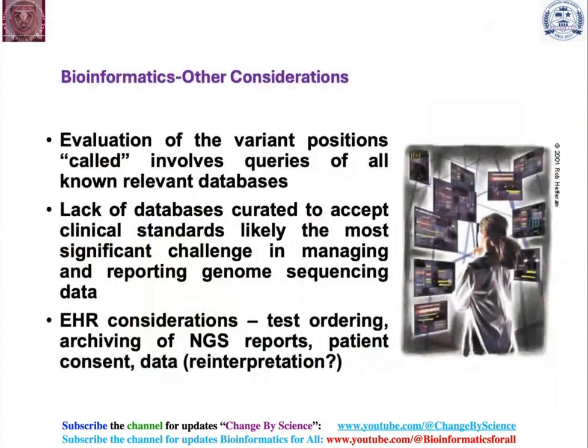analysis. So evaluation of variant positions called involves queries for all the known relevant databases. Lack of databases curated to accepted clinical standards is likely the most significant challenge in managing and reporting genome sequencing data.